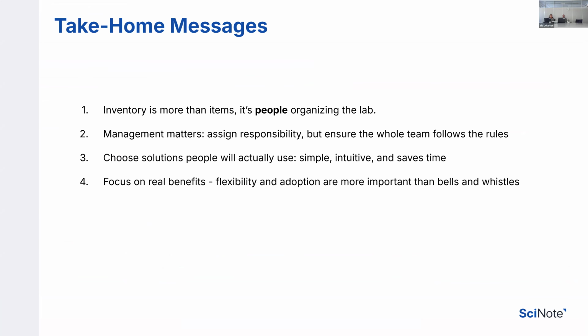Yes, so the main take-home messages are the same as last time, and we would like to emphasize them again: inventory is more than just items, it's the people organizing the lab. Remember that behind every well-organized lab, there is a dedicated team of people that are managing and monitoring that inventory. And one of the biggest hurdles that we are seeing is how people are embracing the new system.